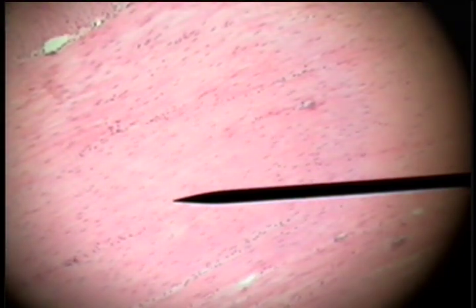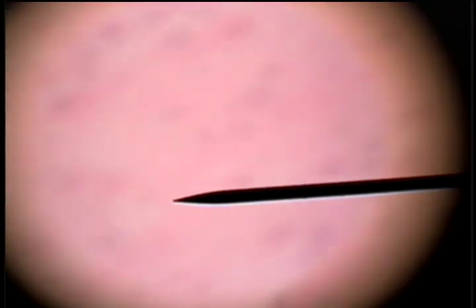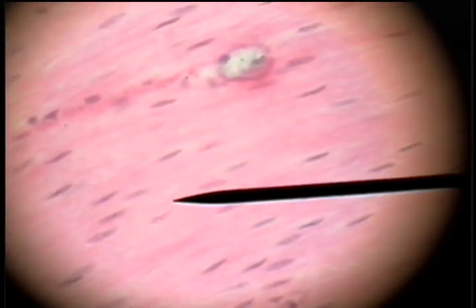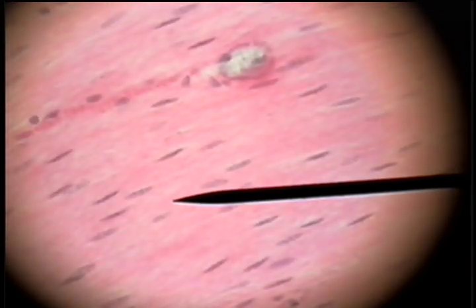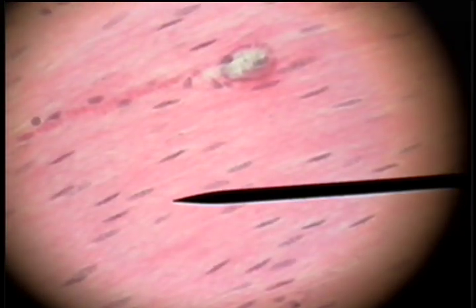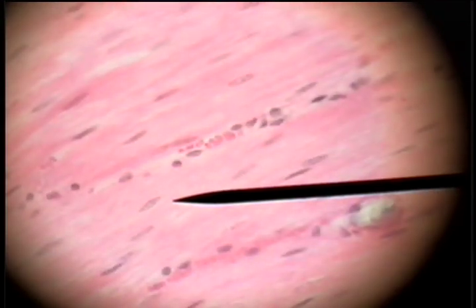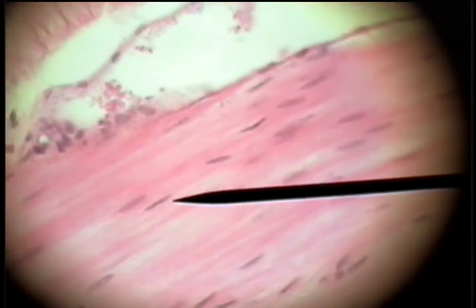We'll go look at this longitudinal section. These cells are small and spindle shaped. They have no cross striation. The nuclei are in a random pattern, and they actually look somewhat like a school of small fish swimming in a stream. This is the longitudinal section of smooth muscle.